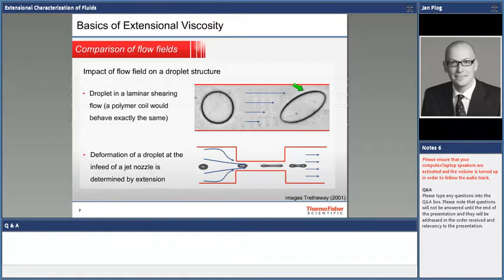And we all know that any kind of structure does not want to be deformed. Nothing wants to be deformed. So this is already a fairly harsh deformation. And we know what happens when we deform structures. Entropy will always be in the structure's neck and tell the structure to relax back to its initial state, because it's entropically, of course, the most stable, energetically speaking, the best state.